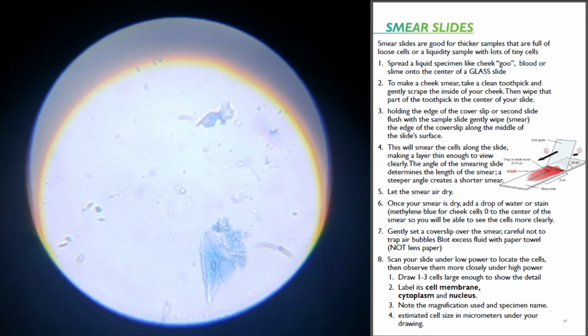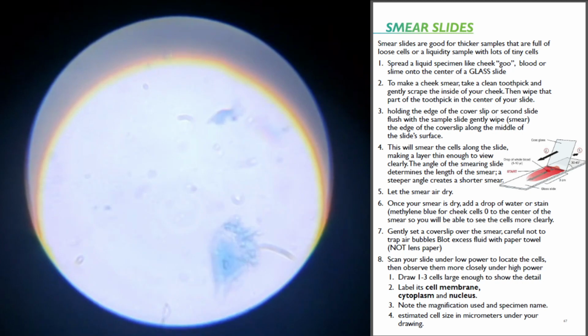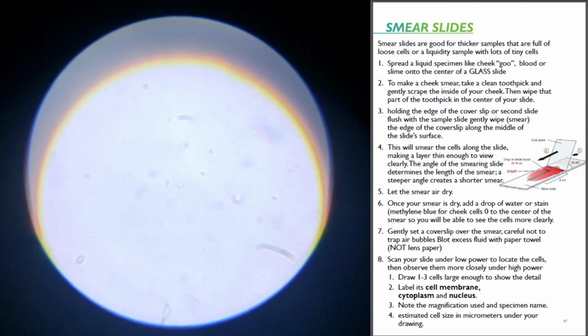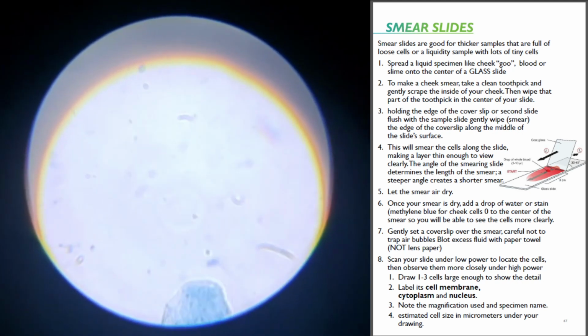Not seeing a lot of movement. So I'll look around. Right now I'm at the right perspective, so I should see everything at that level. Is that moving? No. Of those cells. So let's keep looking around, see if I can find that big cluster, see if I can find any bacteria hiding in there. Individual cell.